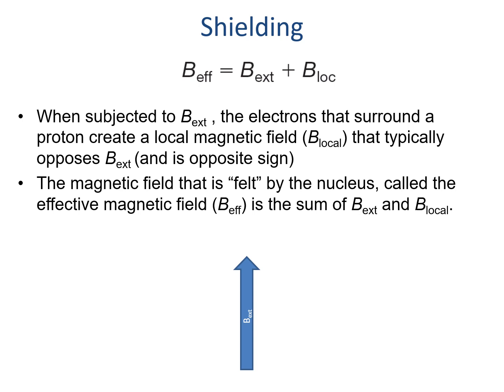The magnetic field that each nucleus feels is going to be some combination of the external magnetic field, the B external, and whatever is going on locally around that nucleus, which has to do with its shielding in many cases. So whatever's felt by the actual nucleus will be its actual signal. Here we have shown a line that indicates the external magnetic field.